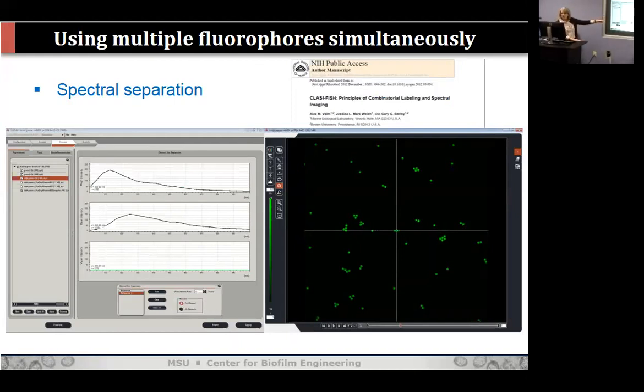I've done it on our confocals. We haven't applied it to a wonderful experimental example yet, but I have beads. Each one of these beads shown here has a green dye on its shell, and then another green dye with a very similar emission spectrum inside. So to our eyes, they're both green. We can't separate them. They use the same excitation, and their emissions are very close.